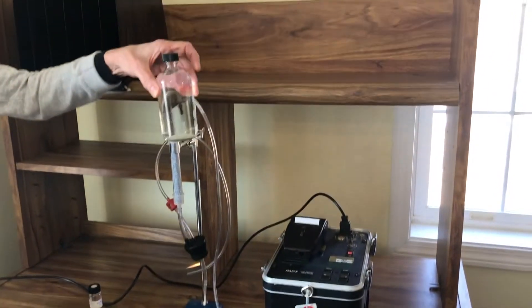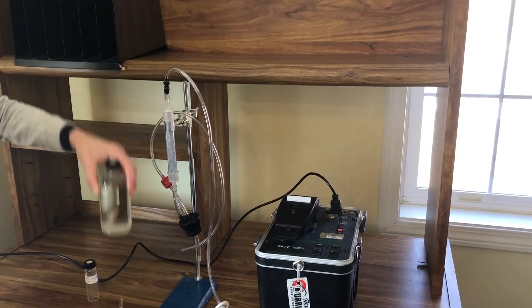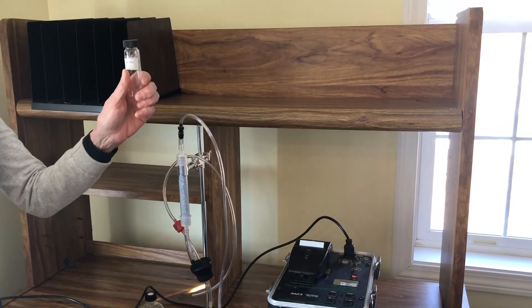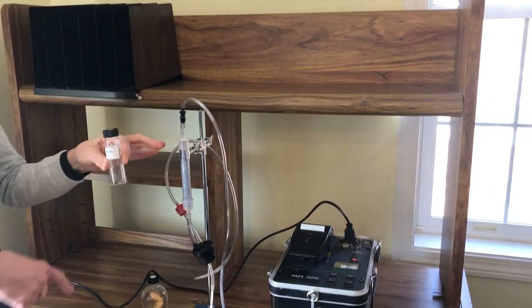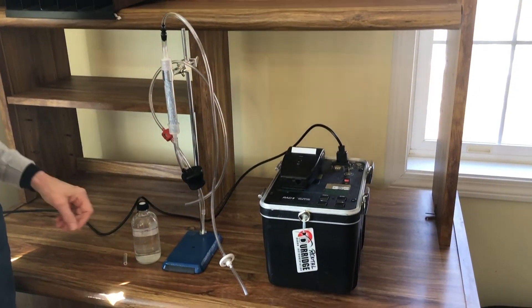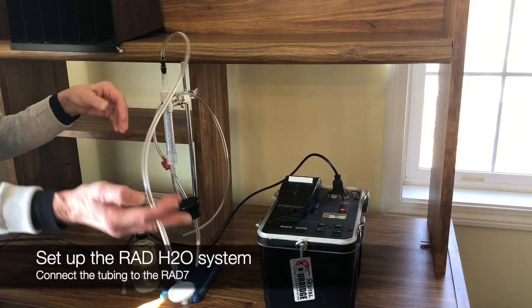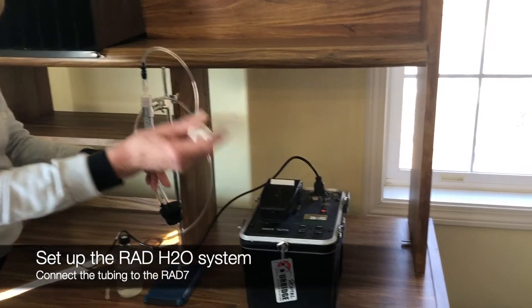Now we have our 250 milliliter sample that we're going to test. You could have also used a 40 milliliter sample. For lower levels of radon, you're better off with the larger sample. This is our drying tube, and this will be going to the rad7 inlet.